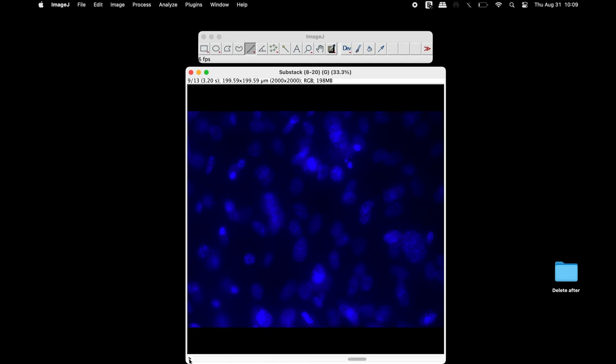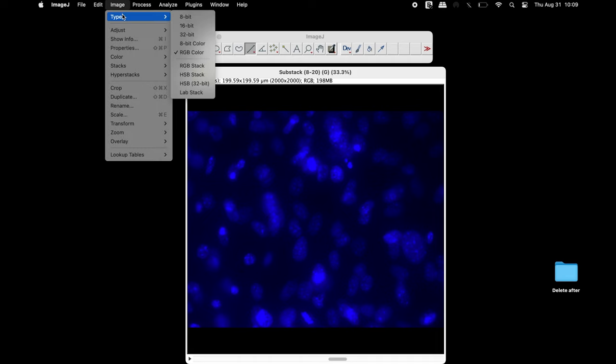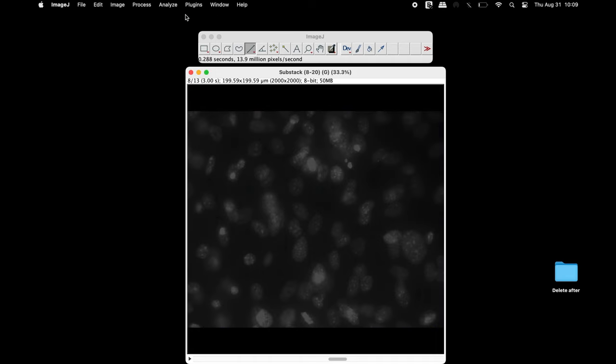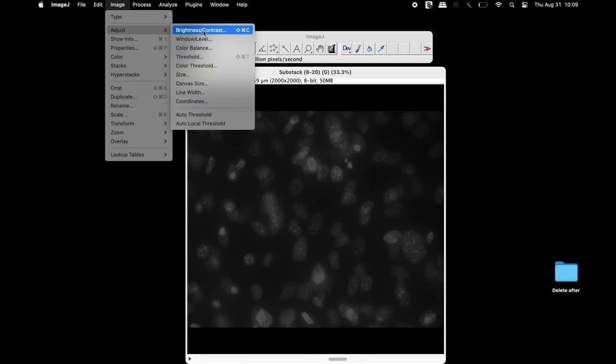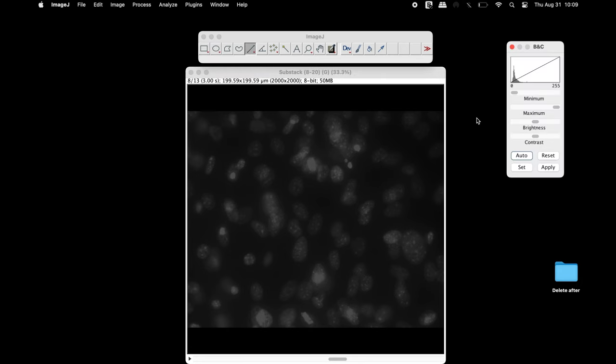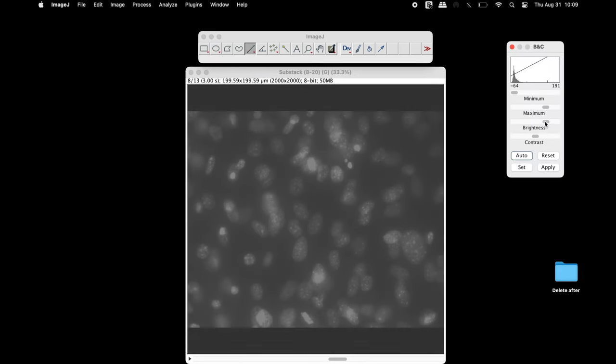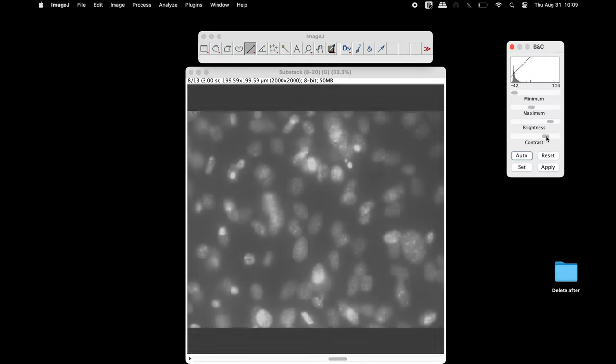To perform the quantitation, change the image type into an 8-bit image. Adjust the brightness and contrast of the stacked image if required.